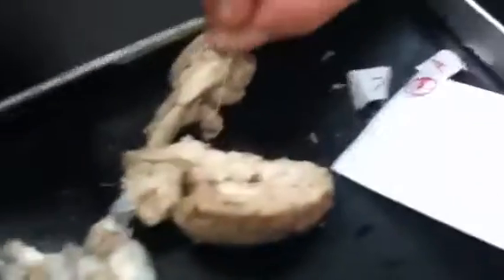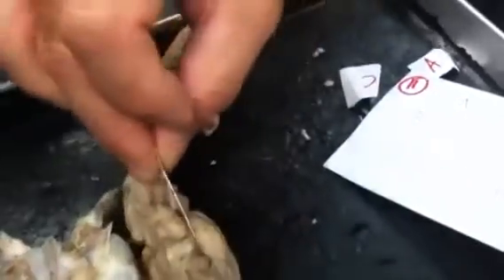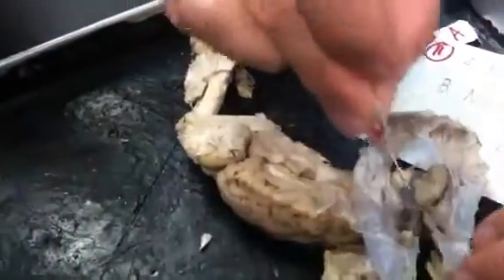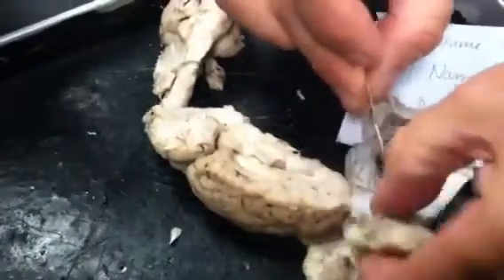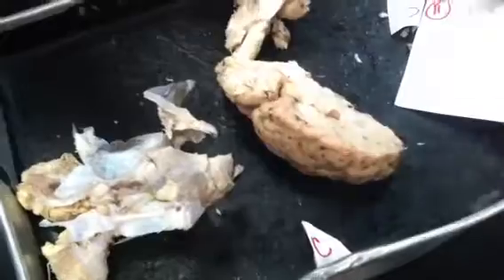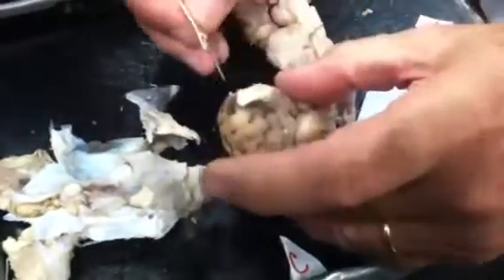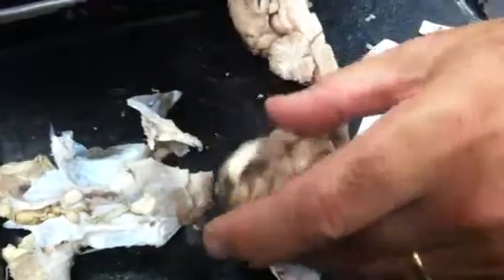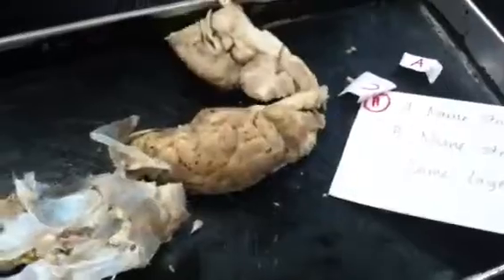And let's see, what did we skip? Optic chiasm. We saw part of the optic chiasm here in mid-sagittal view. Not the best view, but the rest of it's down here, pulled off with the dura. Where's the olfactory bulb? Oh yeah, that's what we missed. The olfactory bulb is this thing right here. Did we get everything else? We did the pineal.